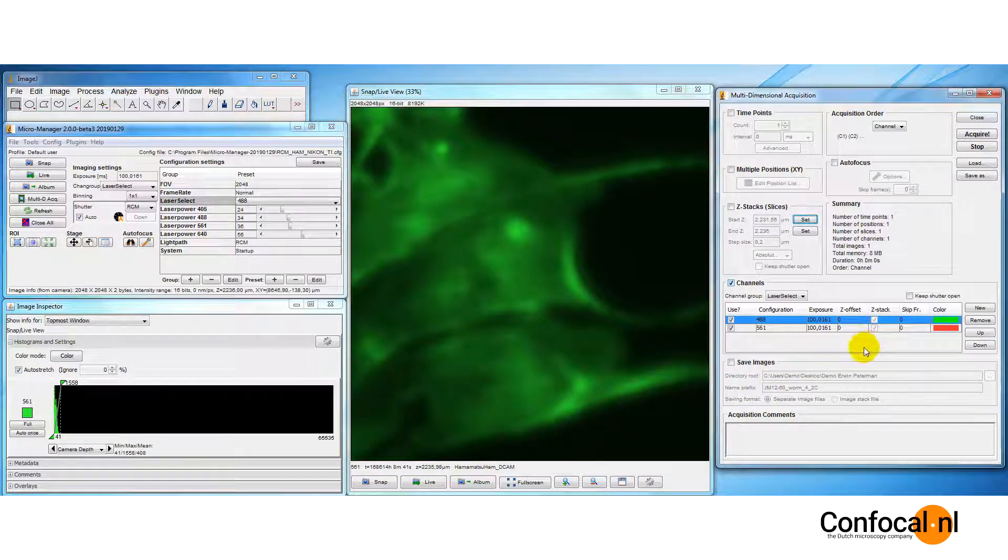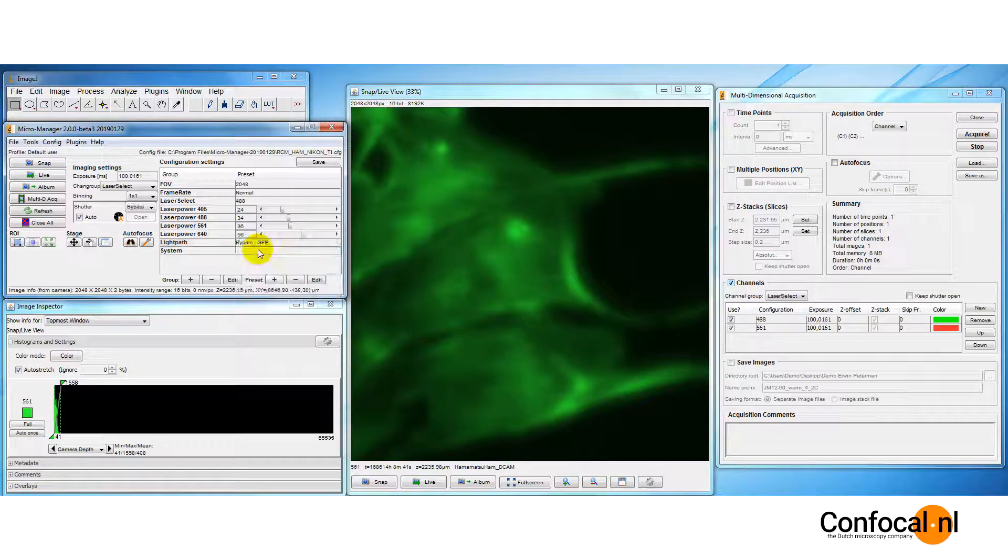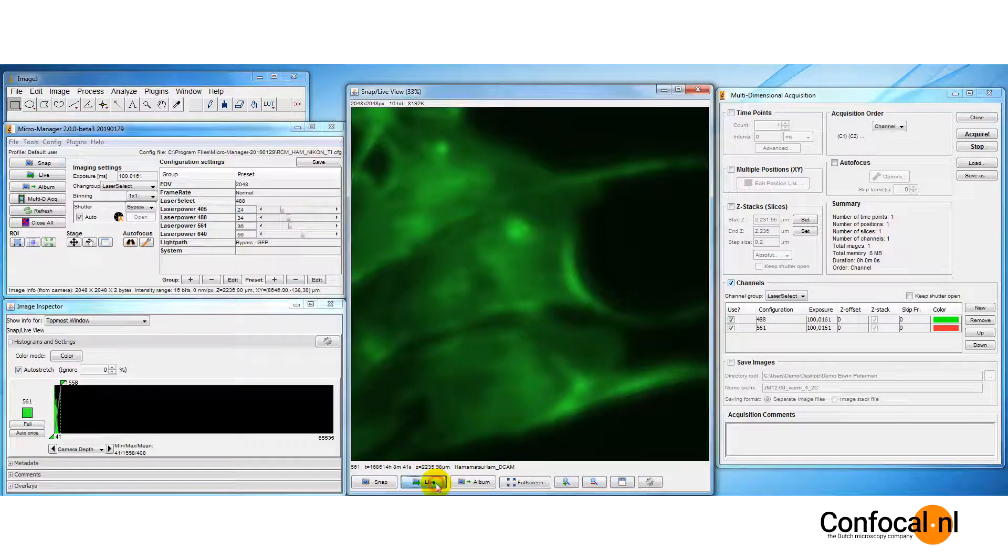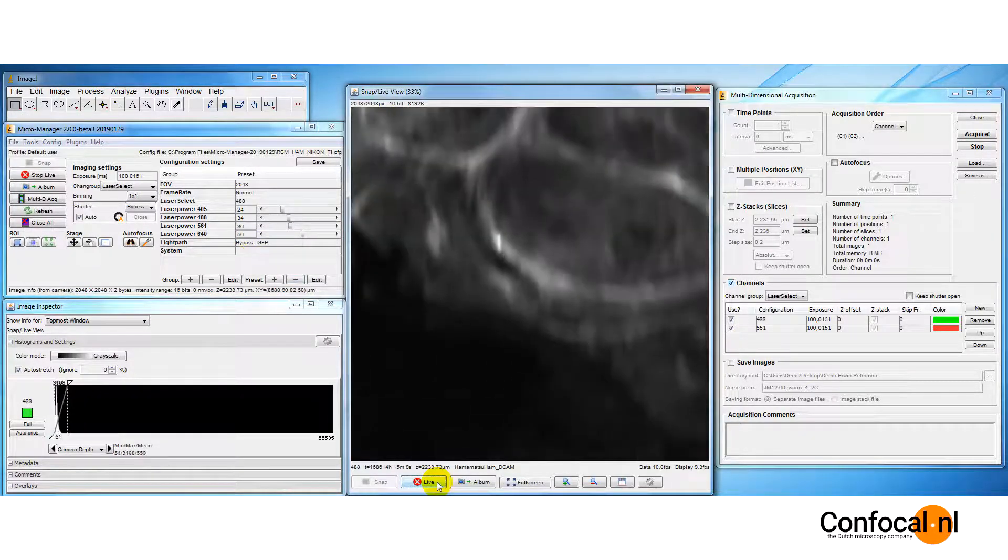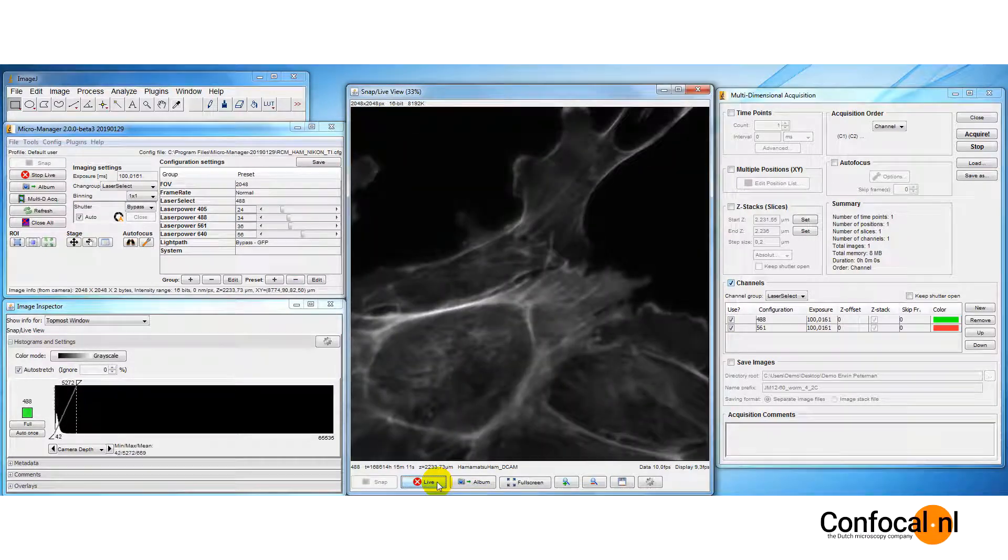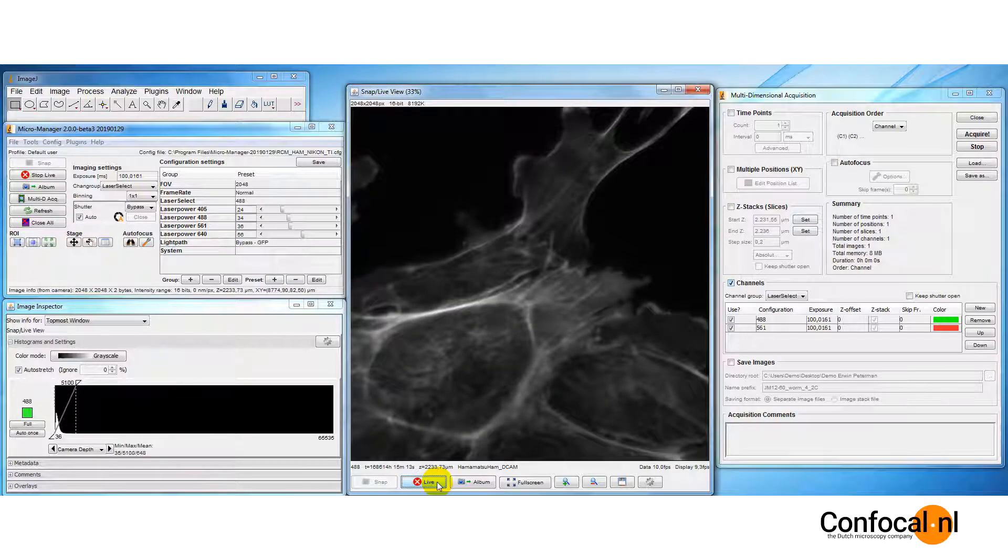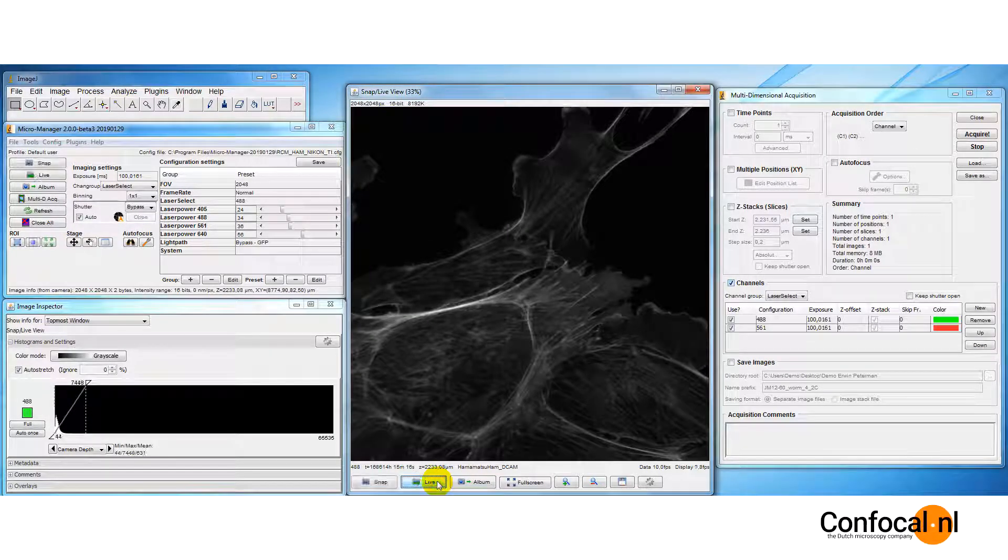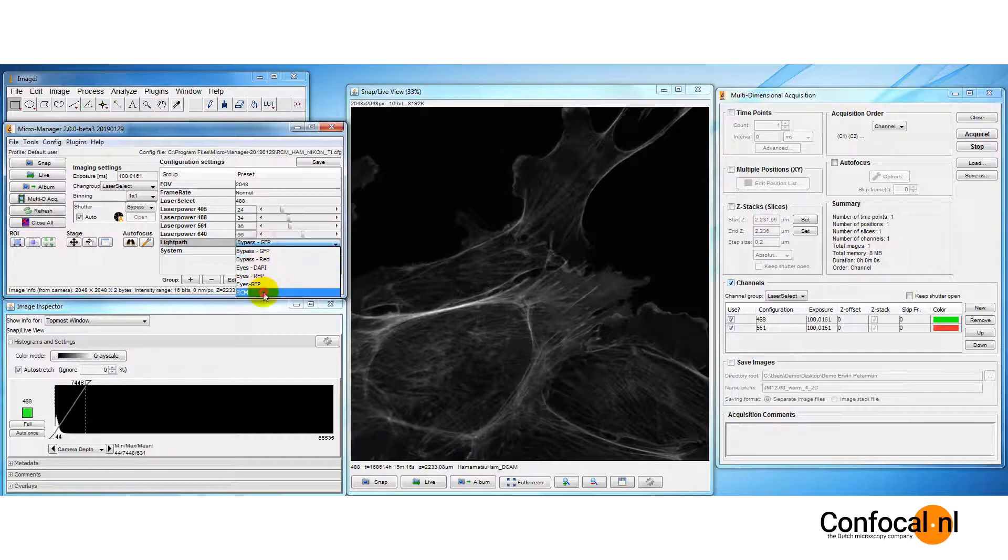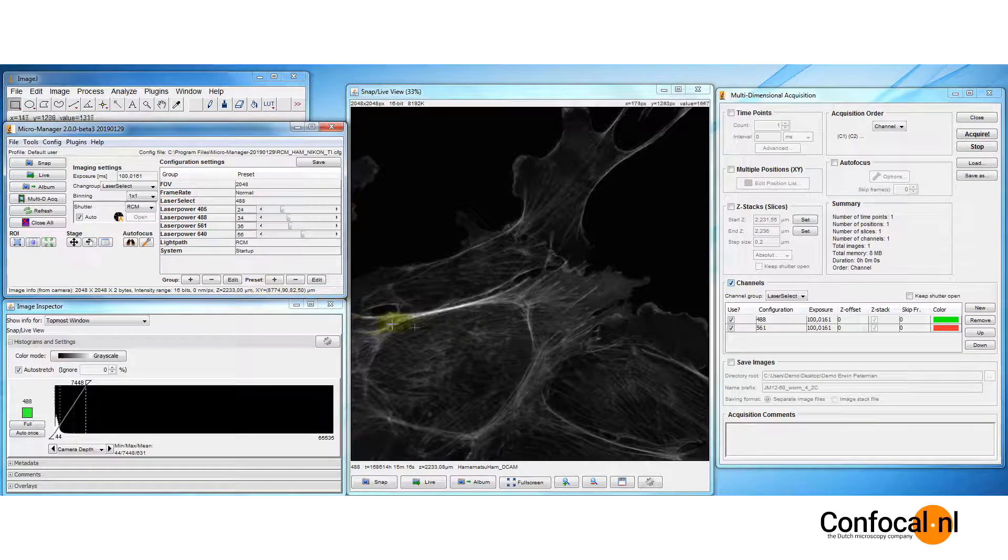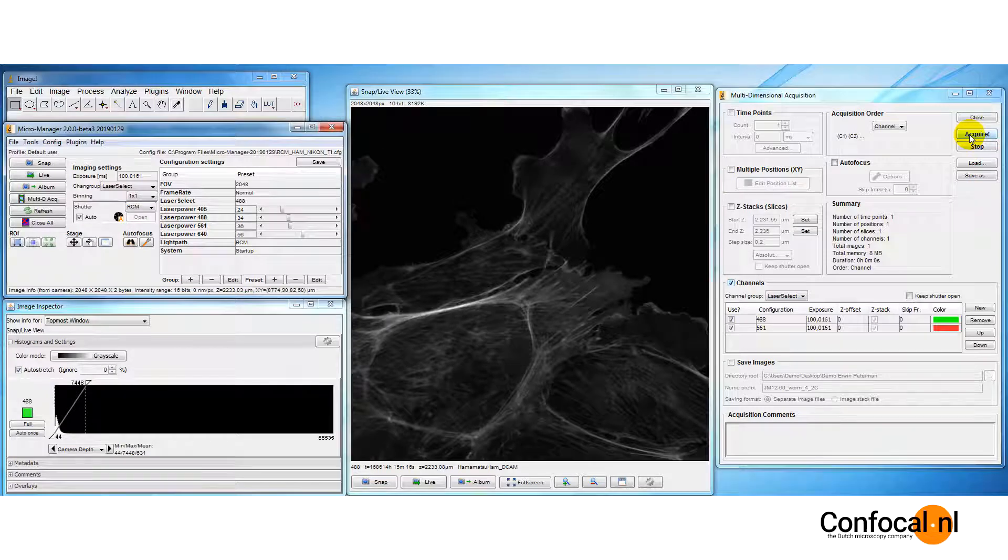Let's find a new region of the specimen by making use of the bypass mode. Press acquire.